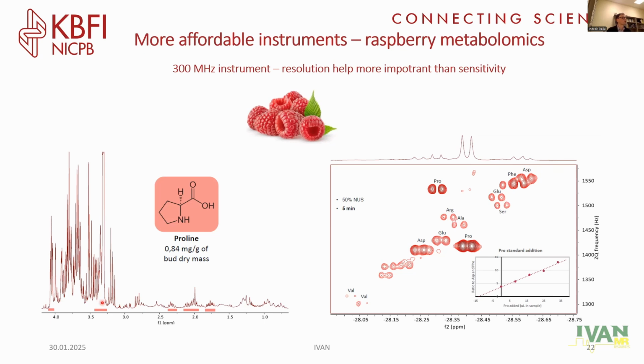Proline has a lot of signals. Over here, each amino acid only has 2 doublets. So it becomes much easier to resolve them. So you may want to do this hyperpolarized experiment not only for sensitivity issues, but also when you want to just comfortably resolve something, and possibly in a lower field situation.